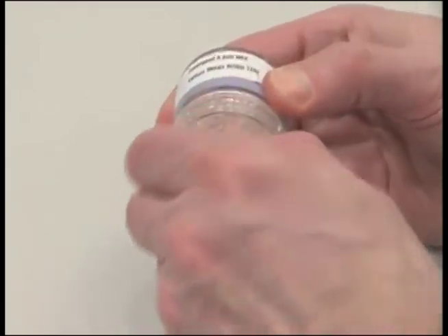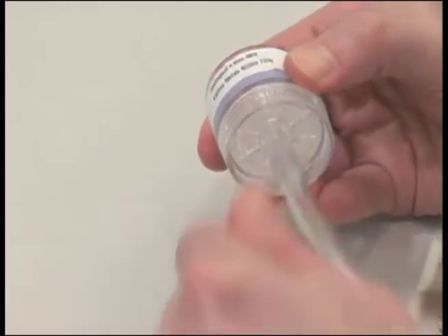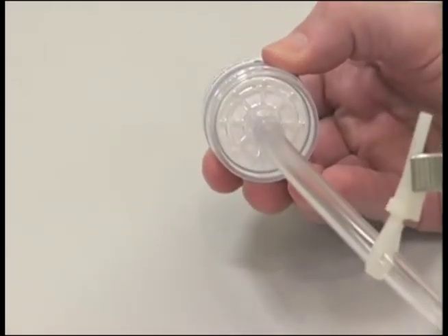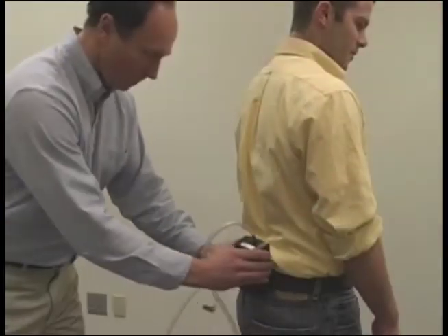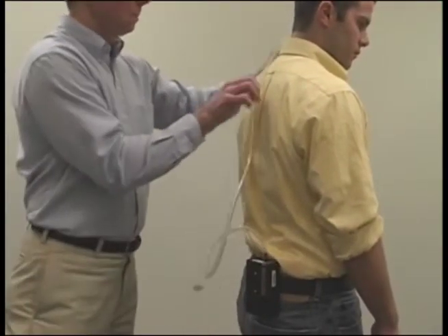To begin sampling, remove the two colored nibs from each end of the cassette. Attach the filter media to the pump with the wagon wheel pattern of the filter attached to the pump tubing. Then attach the pump to the worker's belt or pocket, either in back or on the side.